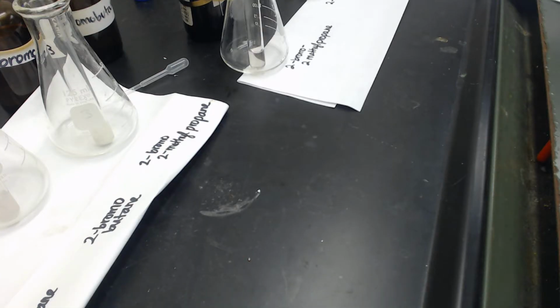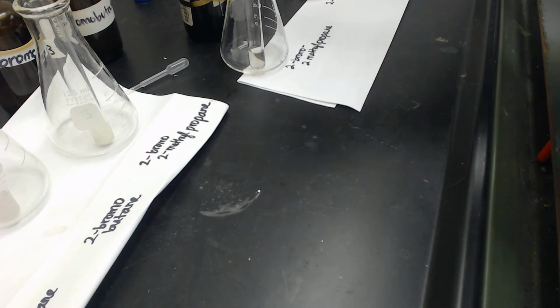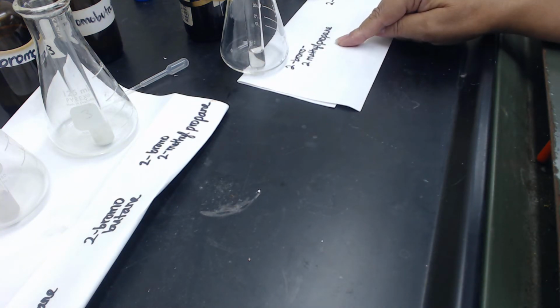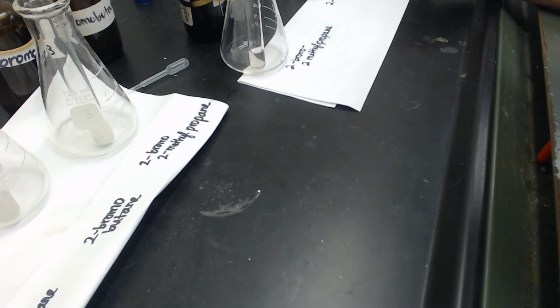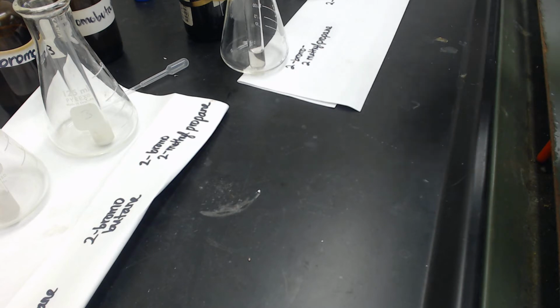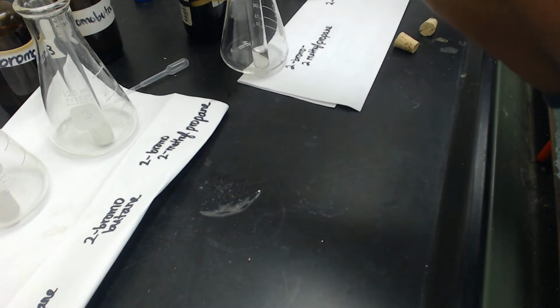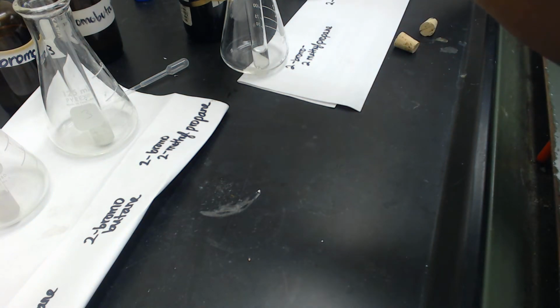So now I'm going to do the second part, the effect of the leaving group. So this time I have already measured 2 milliliters of the 1% silver nitrate in absolute ethanol. And this time I'm going to put 2-bromo-2-methylpropane on the left and 2-chloro-2-methylpropane on the right. So we're going to see the effect of the leaving group. Let me get ready with my test tubes. So let's see if I can add these at the same time. See if I'm ambidextrous.